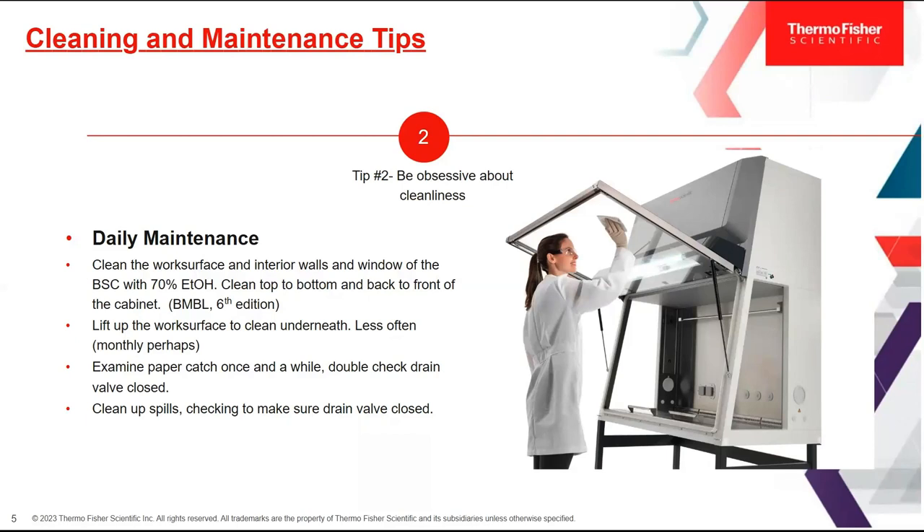Also make sure your valve is closed when you're looking under the work surface. Sometimes the valve will be open because there was a spill and someone was neutralizing it and removing contaminants through the valve — just make sure it's closed, because if it is open and you have a spill, it could come through the BSC and get onto your floor, which would be much worse.